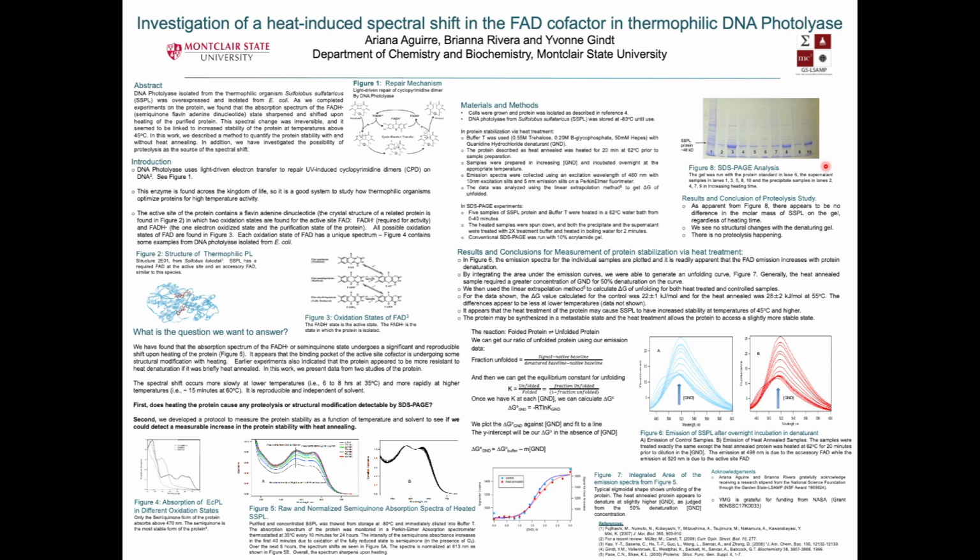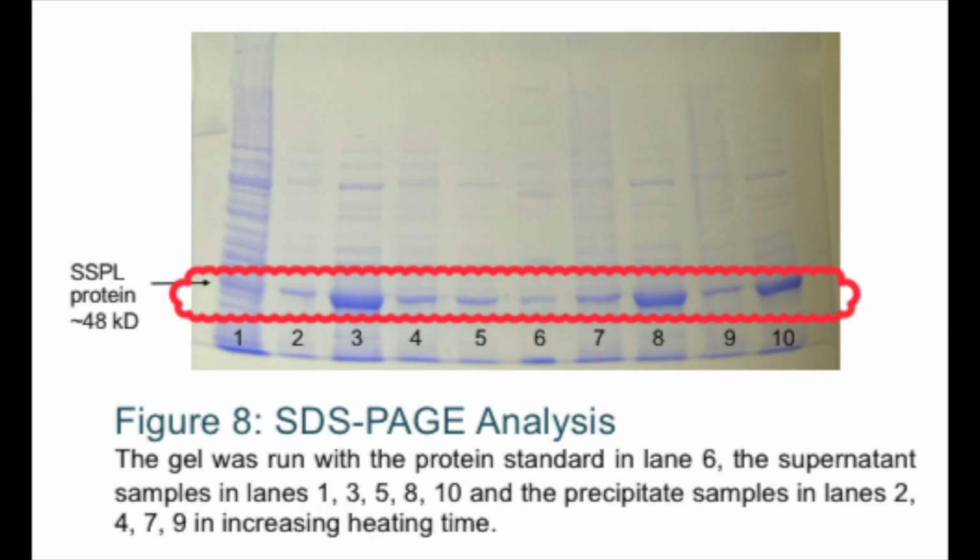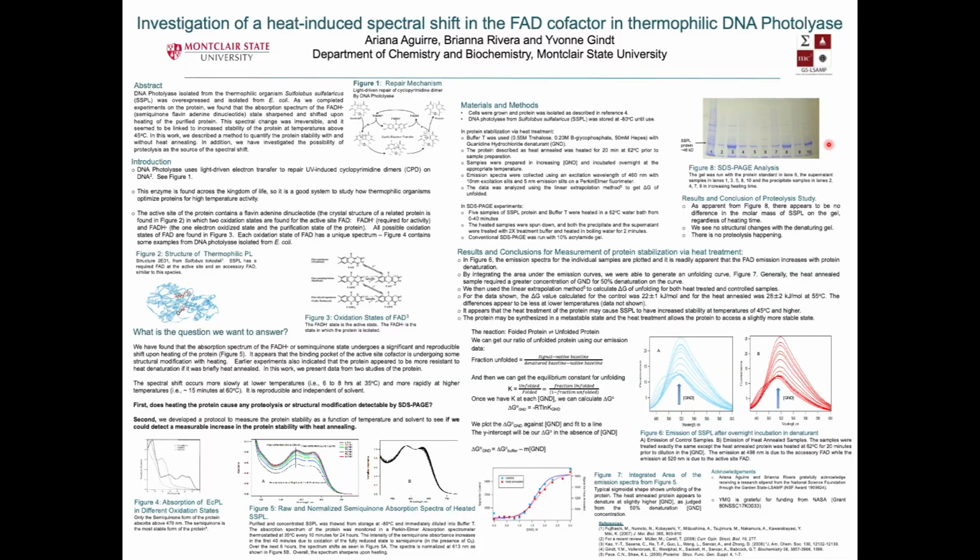This gel shows a very deep color band around 48 kilodaltons, which is our protein. As you can see, the protein doesn't change how it runs, so there doesn't seem to be any degradation of our protein in these samples, thus disregarding the idea that proteolysis is going on.